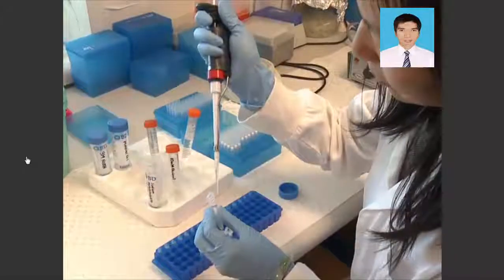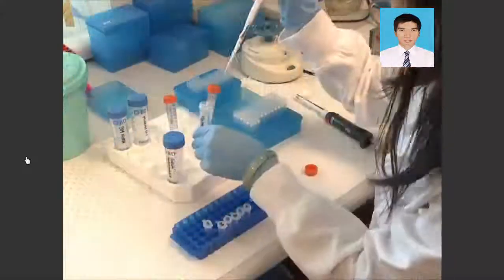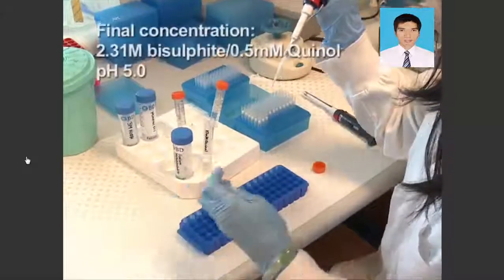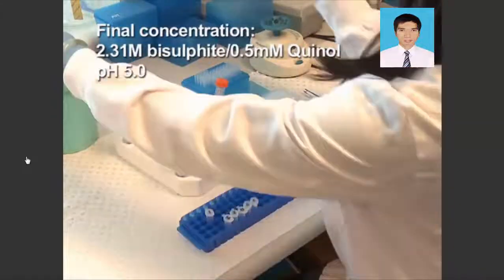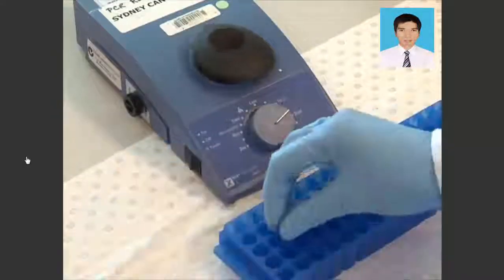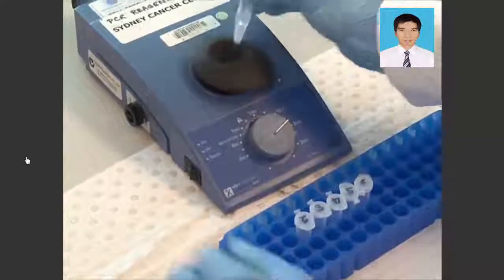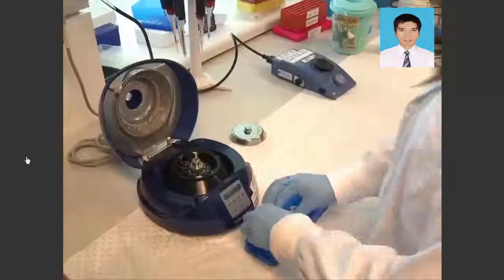Add the sodium metabisulfite and quinol to the denatured DNA in a final volume of 240 microliters. Vortex the tubes and centrifuge for 10 seconds to ensure all of the droplets are at the bottom of the tube.